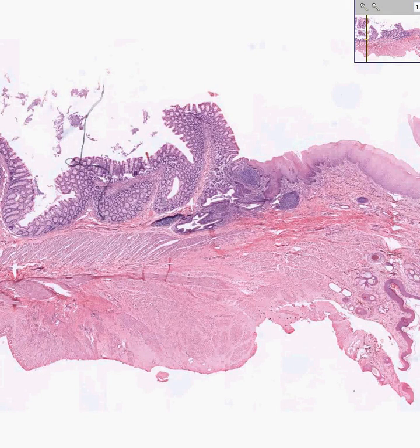There are several areas in the body where we have a transition in surface epithelium from a columnar or single-cell type of mucosa into a multi-layered or stratified squamous type of mucosa. The anal-rectal junction is one of them. Others include the gastroesophageal junction, as well as the squamous-columnar junction of the cervix, where the ectocervix changes into the endocervix.